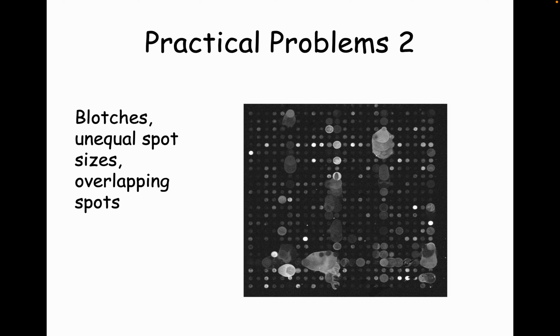You can compare the intensity of the spot to the intensity around the spot, which would tell you whether your spot has sort of bled. Something like this is just a very big spot, but you could look directly in between, like on the diagonal in between these. That would be a good spot to measure background right there. And you can see, yeah, that background is still nice and black, and so this would be potentially usable, whereas this would probably not, because the background spot would be right there.